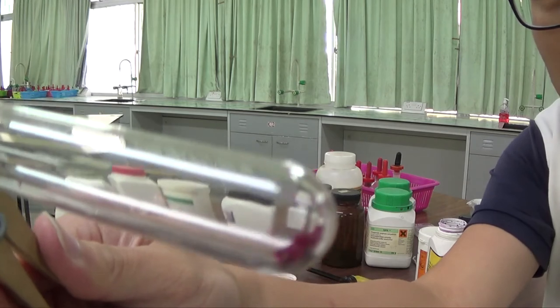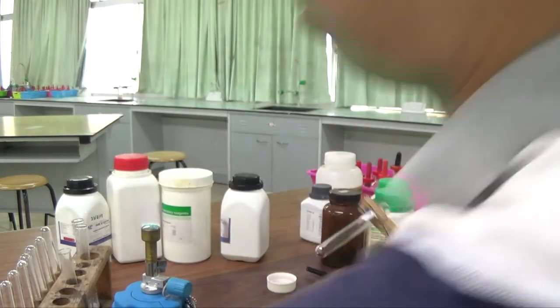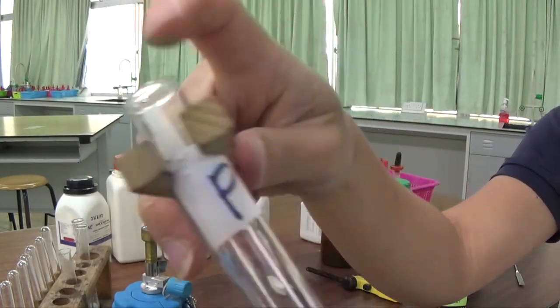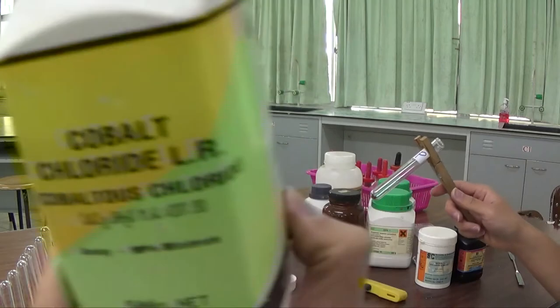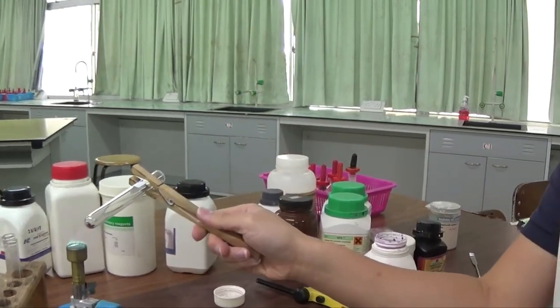Pink color solid. Let me see if I can get a white background. Pink color solid. The test tube is dry. If it is not dry, it will have stuck on the side. Okay, so dry upper part, dry lower part. Pink solid. This was cobalt, well, this is cobalt 2 chloride, hydrated. Okay, let's see what happened when we heat it.